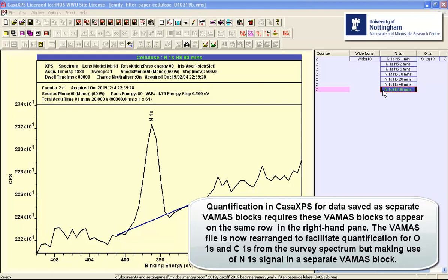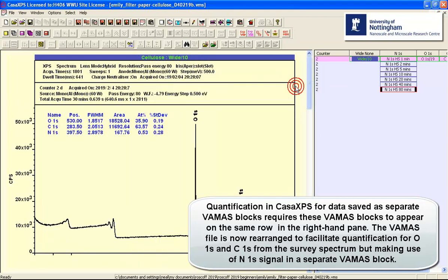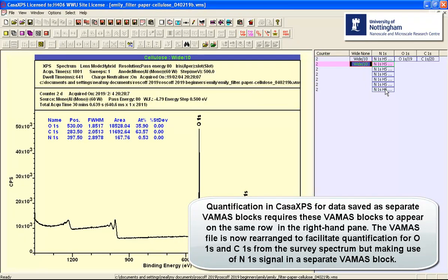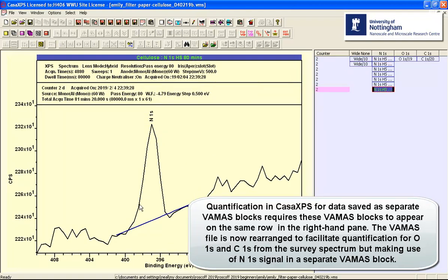I wish to quantify now the survey against this nitrogen 1S that was measured for 80 minutes. And in order to do this, I need to have these two in the same row. One way of doing that would be to take a copy of the survey spectrum. So here it is, the copy, and here's the narrow scan data collected at 80 pass energy, just the same as the survey spectrum, just a longer acquisition time.